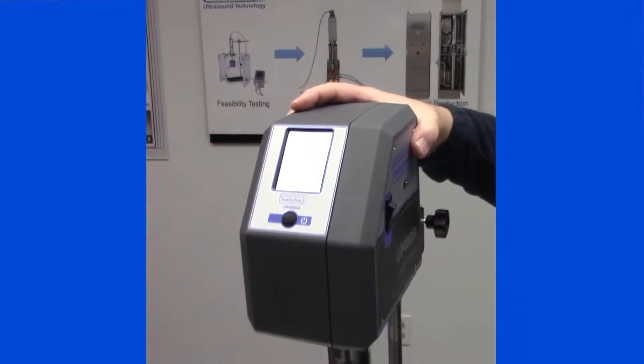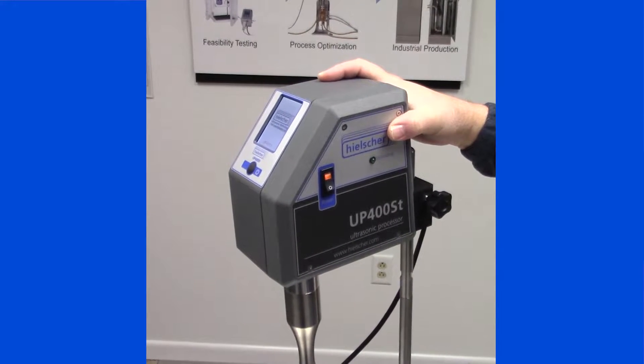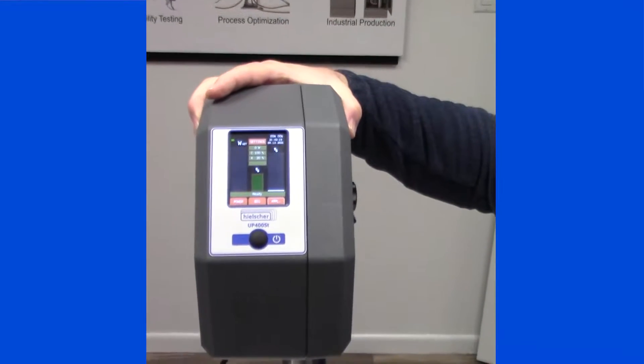On the side of the unit, we have the main power. By depressing the switch, we'll turn the unit on. There we go. And this is your main screen.